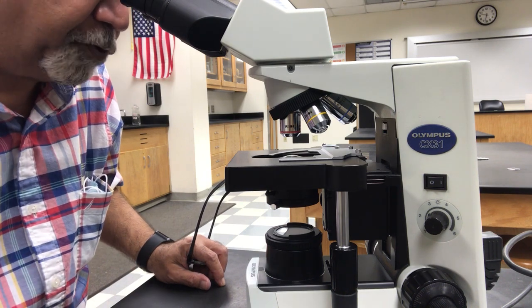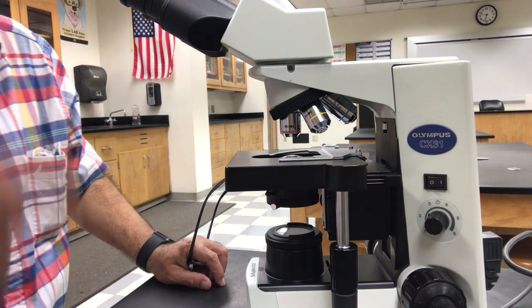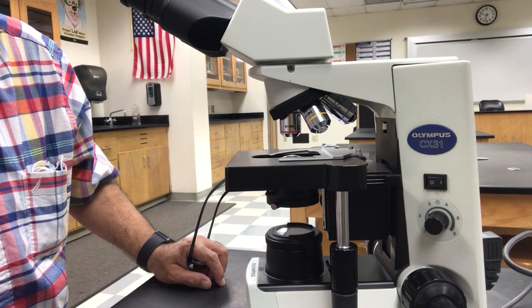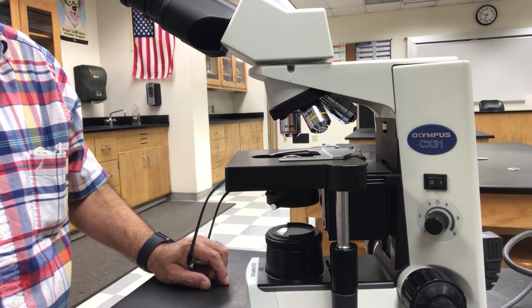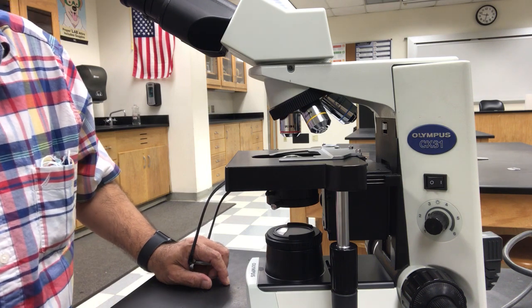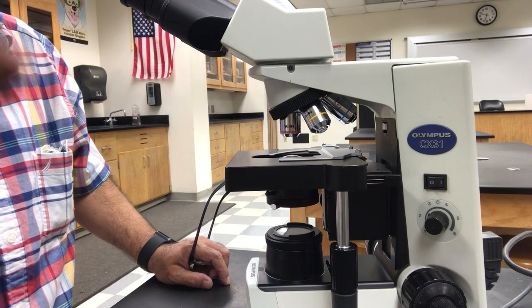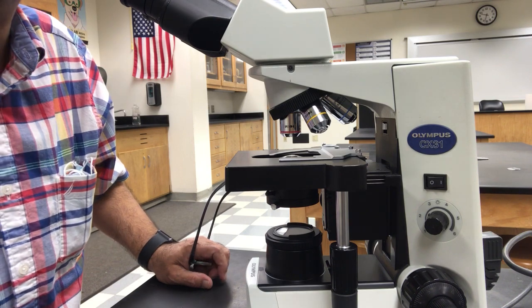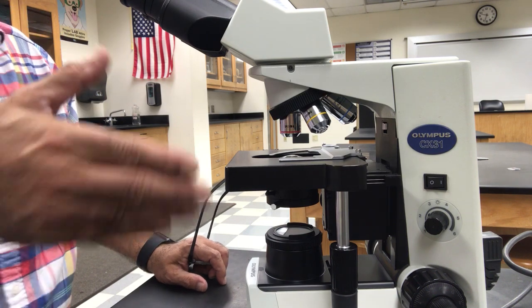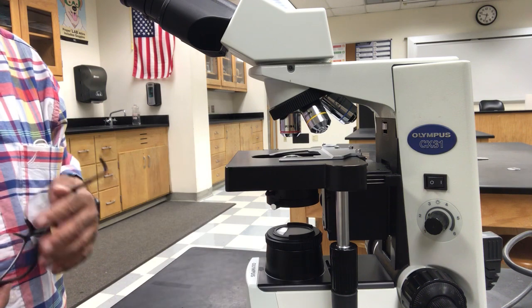And inside you would see a pointer, a built-in needle-like structure that allows you to pinpoint a structure you would want to see, or you would want your instructor to look at and identify for you. And we use that pointer and put it on a specific structure, like a nucleus, and ask you to identify that structure.